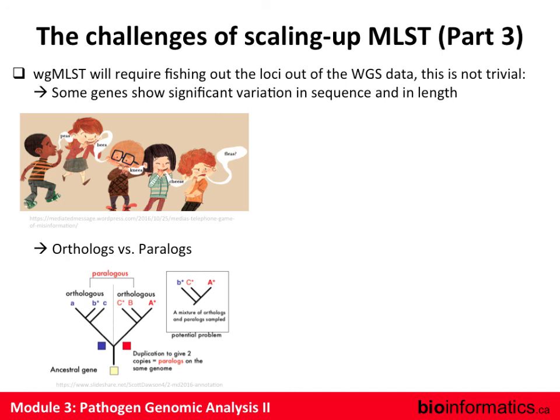Then we have this whole issue of paralogs versus orthologs. I don't know if anyone does. Is anyone familiar with that concept? Anne.